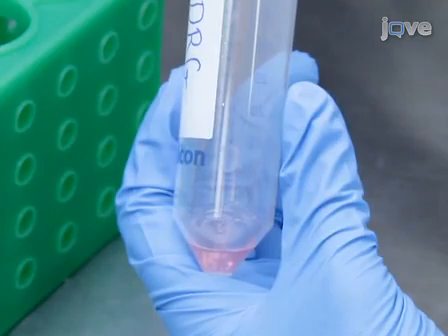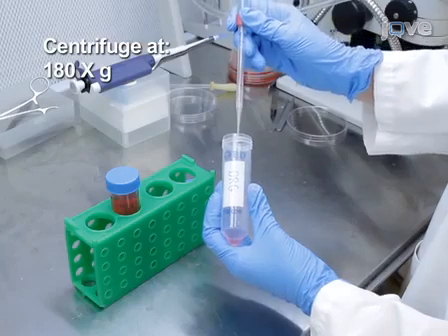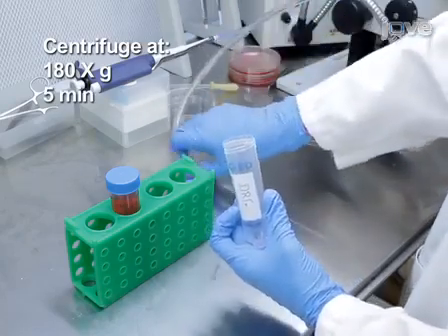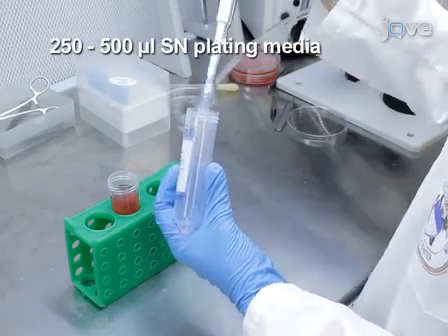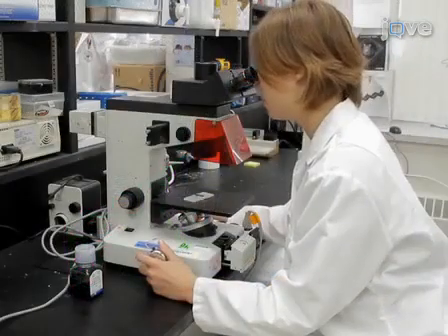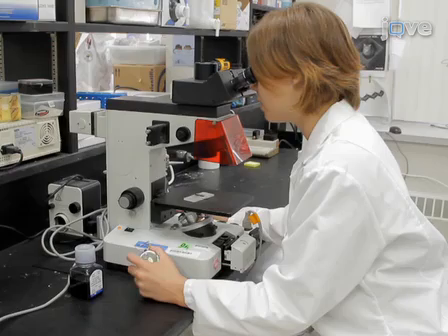Avoid bubbles. After spinning the homogenate at 180 times gravity for 5 minutes, remove the supernatant and resuspend the cells in a small amount of sensory neuron plating media. Count the cells using trypan blue exclusion to identify live cells. The cells are now ready for plating.